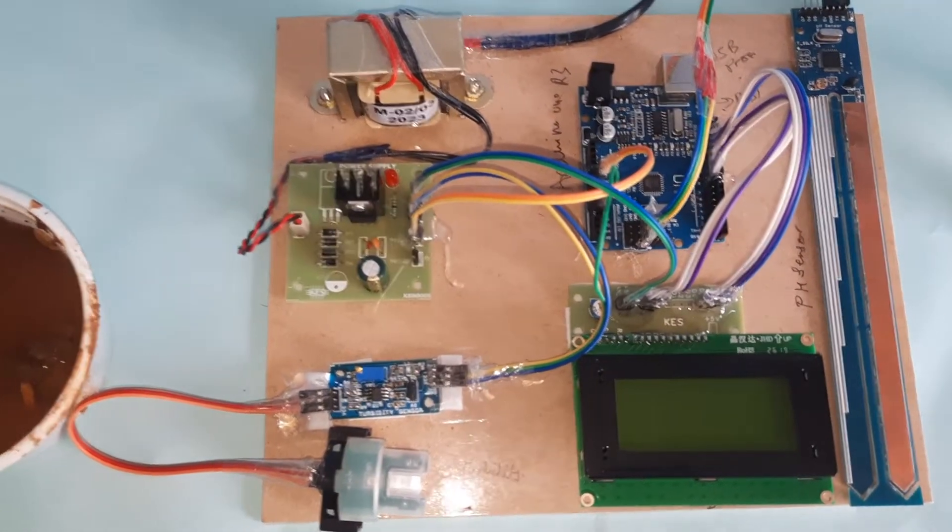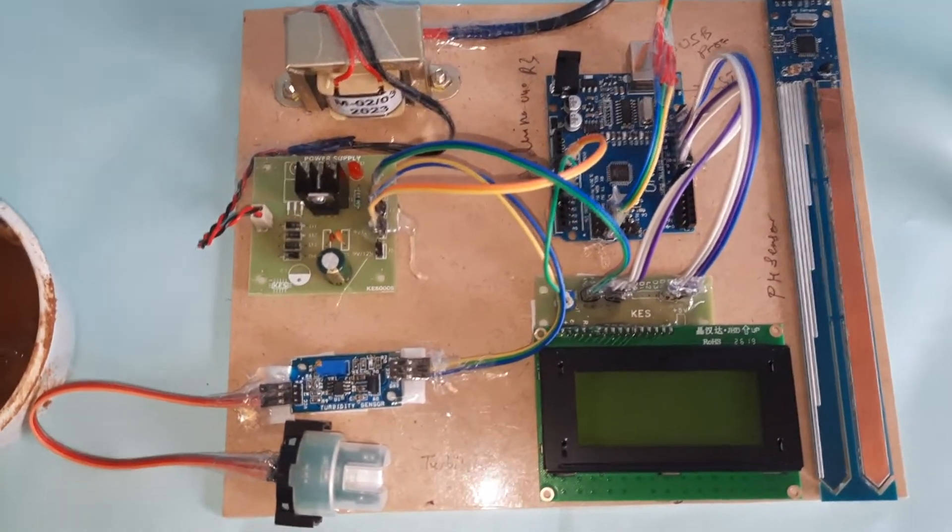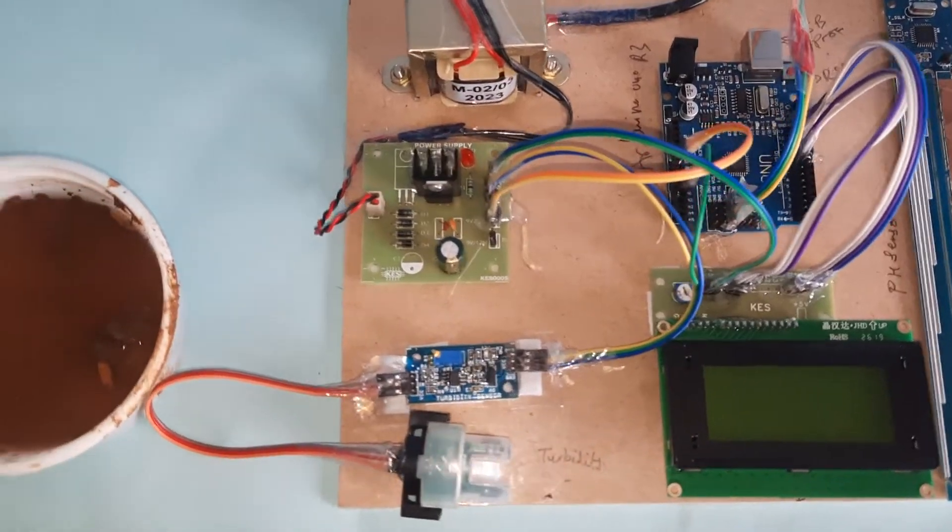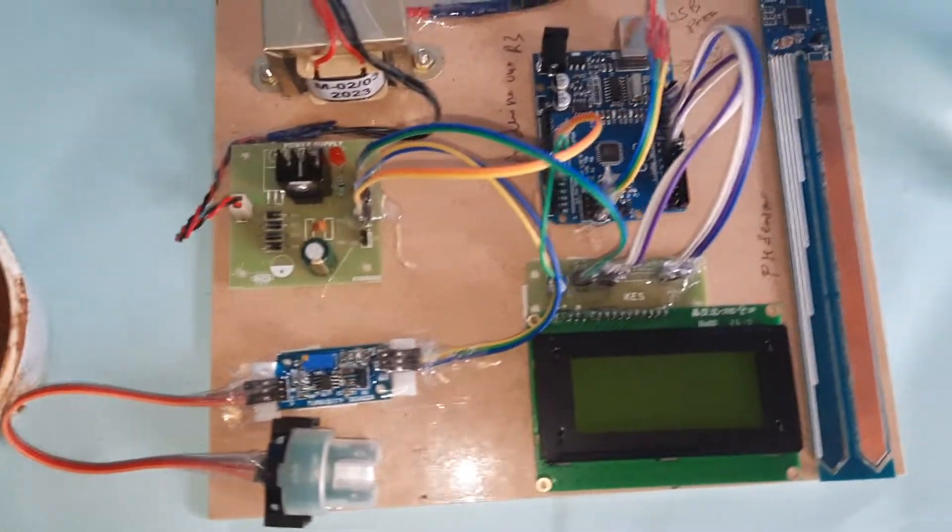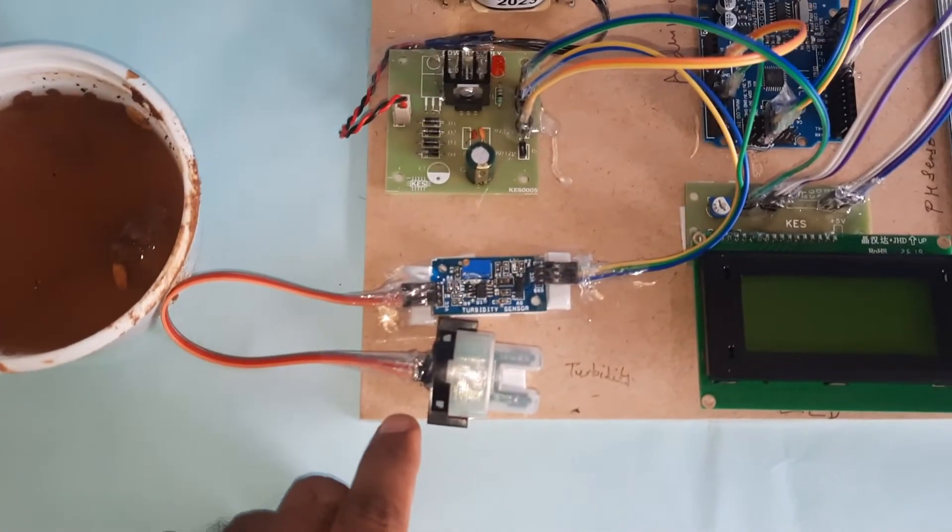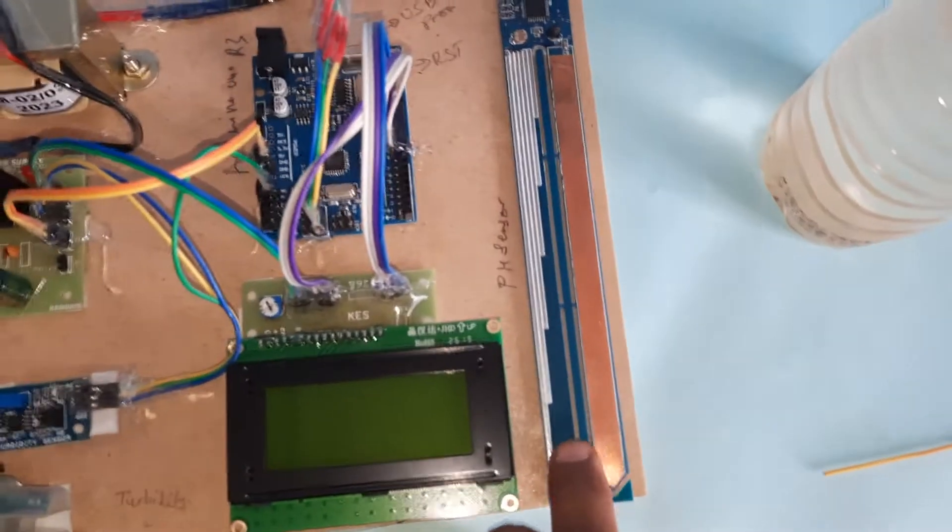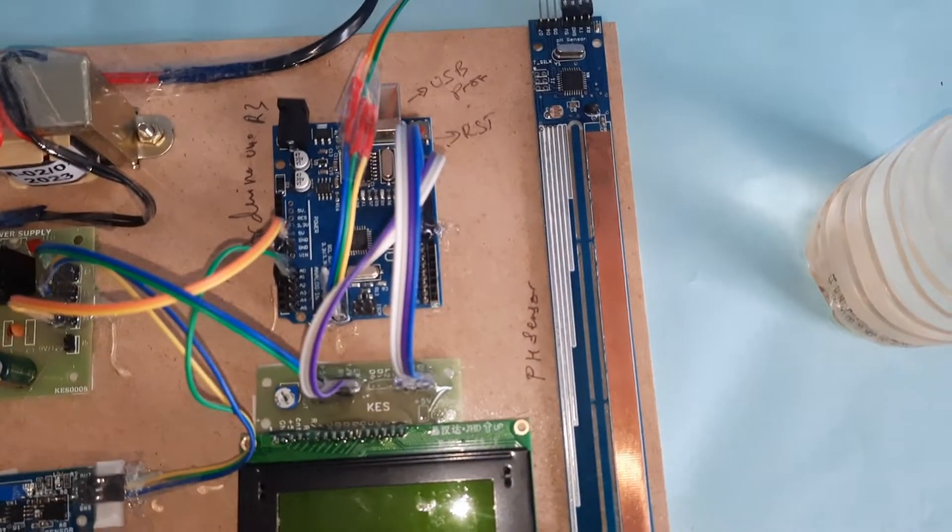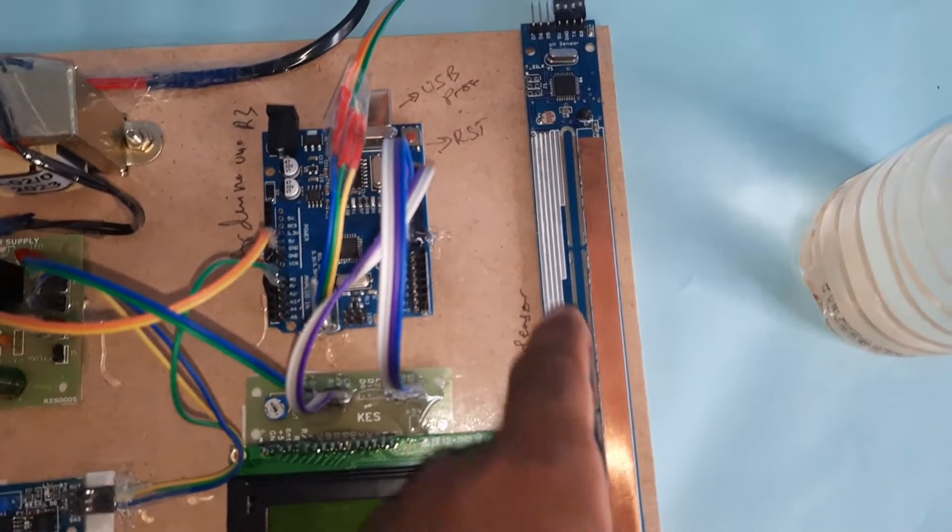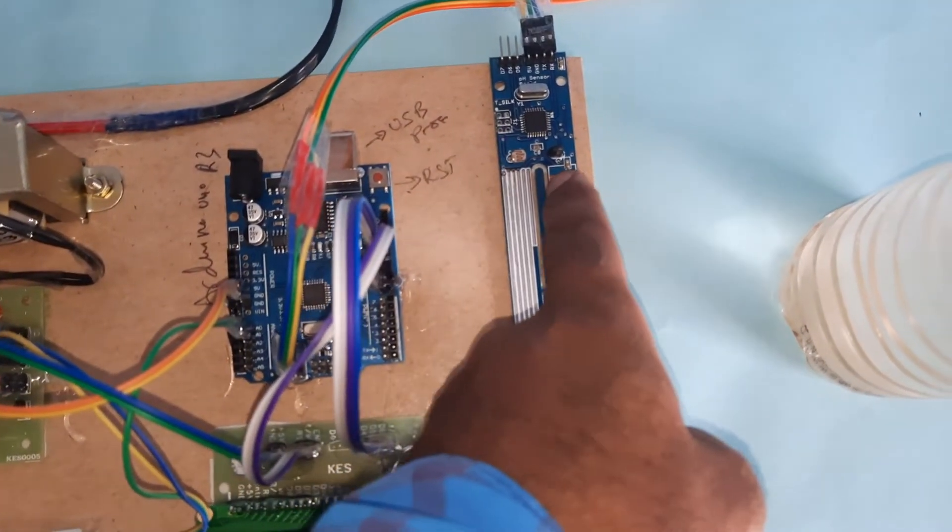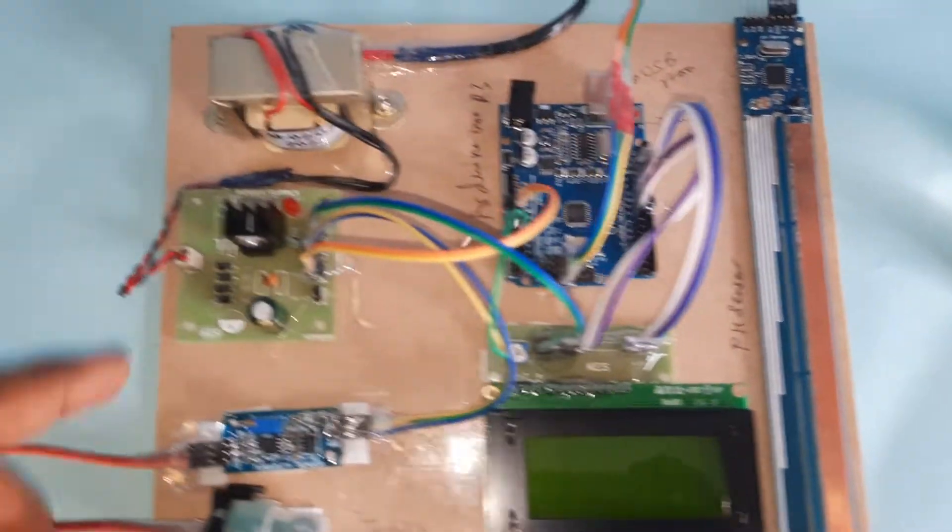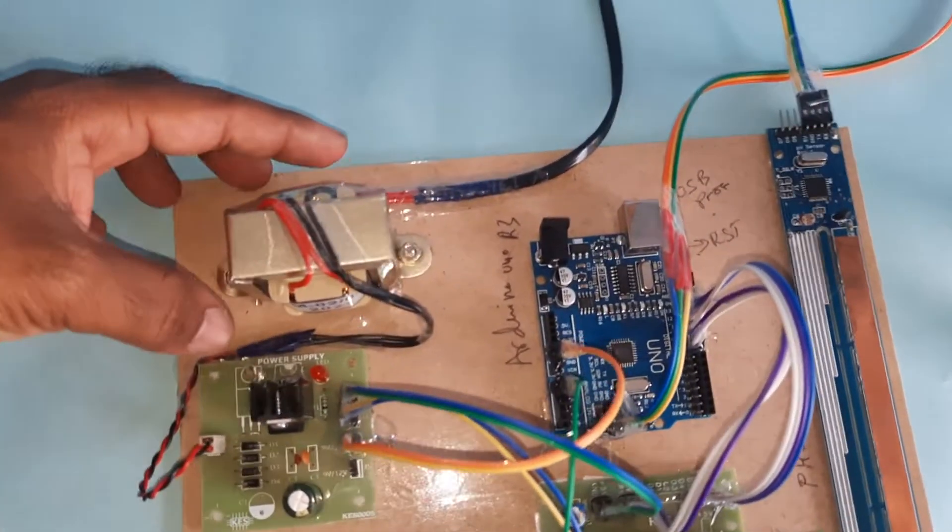Hi, this is a water level quality monitoring system. In this project we are using a turbidity sensor, pH sensor, water level detection, LDR sensor, and temperature sensor.